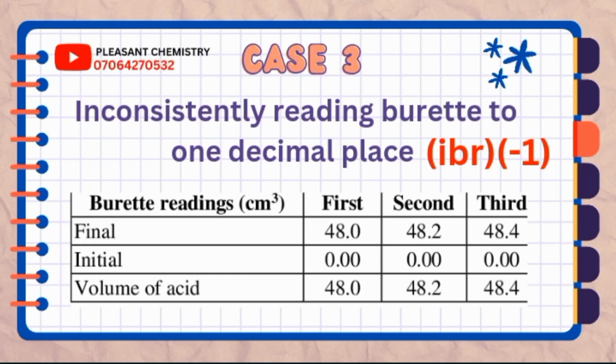Now, this is the error I'm talking about. In the diagram, you are going to see final Burette reading, initial Burette reading, and the volume of acid used. The initial Burette reading is measured in 2 decimal places, while the final and the volume of acid used were in 1 decimal place. So, in that case, it is inconsistent. Your Burette reading must be in 2 decimal places. Please take note of that.